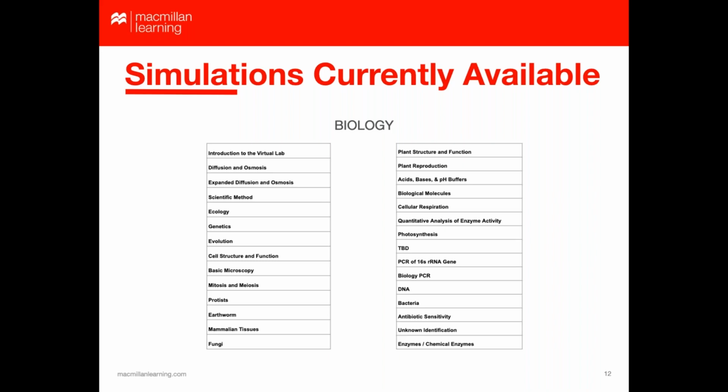Yeah. The other nice thing is, I showed how the meniscus isn't always exactly the volume that they added. So that will also help a little bit if they're giving kind of the same answer over and over again. You can put up a little bit of a flag and say, actually, you should be able to read that a little bit differently. So we've thought through a little bit of that academic honesty piece of it, and really wanting students to actually interact with the interactive, and give those answers that they're seeing, not just give the same answers to every student.